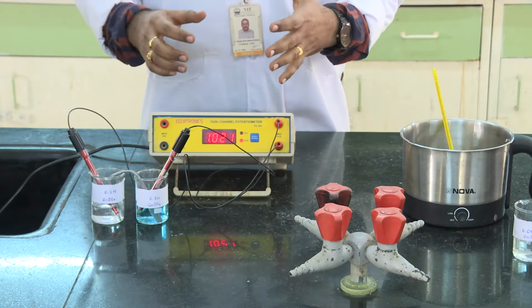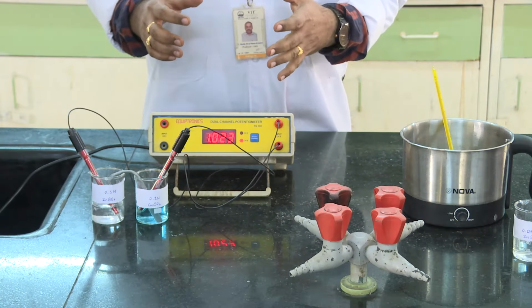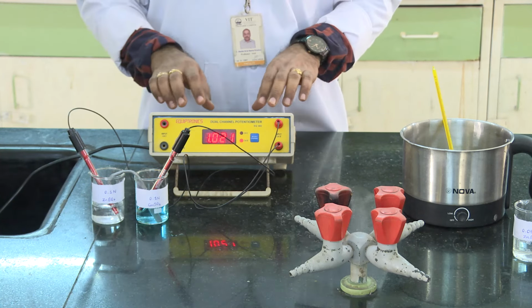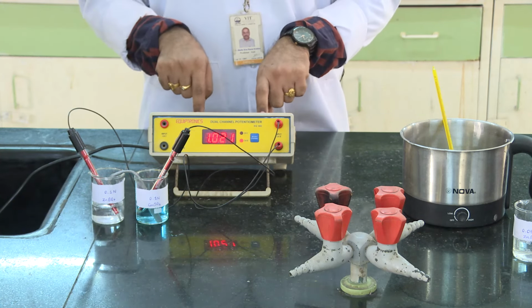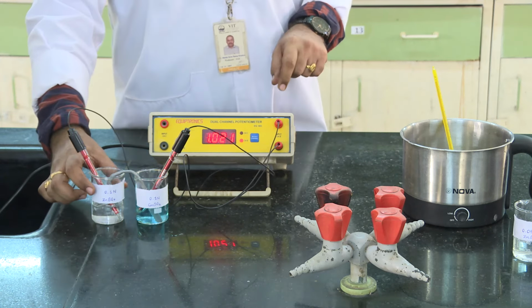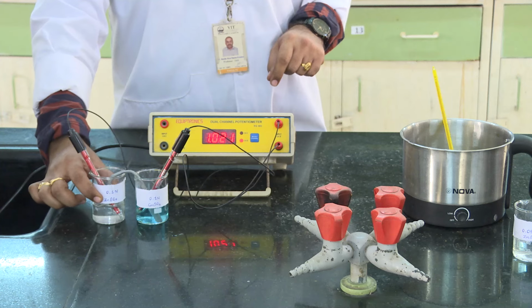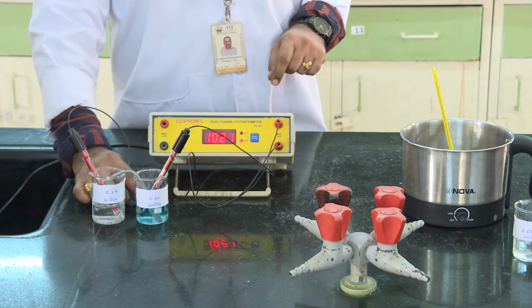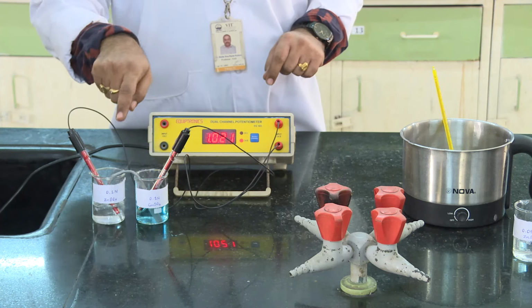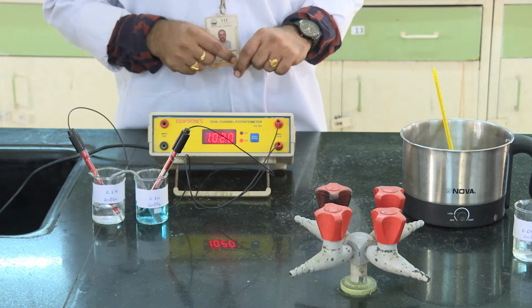Now we come to the construction of a Daniell cell. Using that zinc system and copper system, we put them together and connect them to the potentiometer. Here we have used 0.1 normal zinc sulfate and 0.1 normal copper sulfate, both connected with the salt bridge.